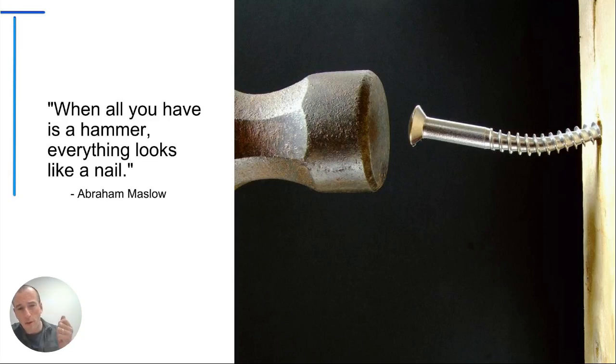And so when we only have one thermal conductivity method, each method has its own certain orientation or bias. You can get into some problems in applying it in situations which it was not really designed for. And so this is all part of what we want to convey in the presentation, is educating on what the appropriate applications are for the different types of test methods in thermal conductivity.